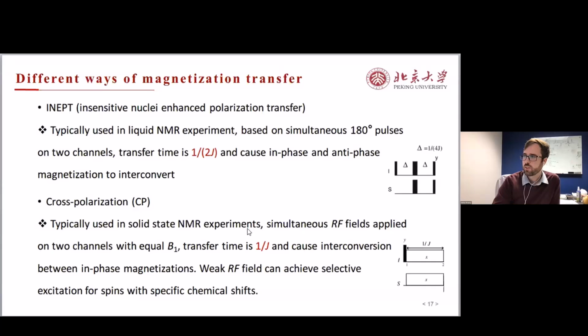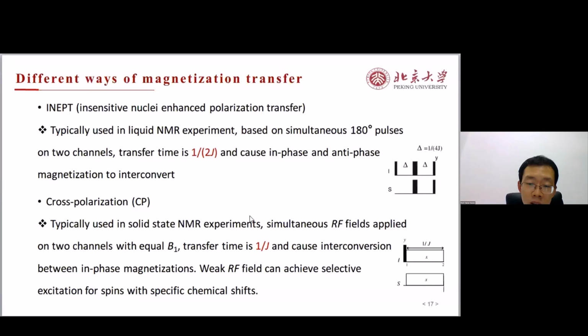I have a question here from Moshe, saying, what are the general rules and tips to determine and optimize the power of a gradient pulse? You say, to optimize the pulsed field gradient.